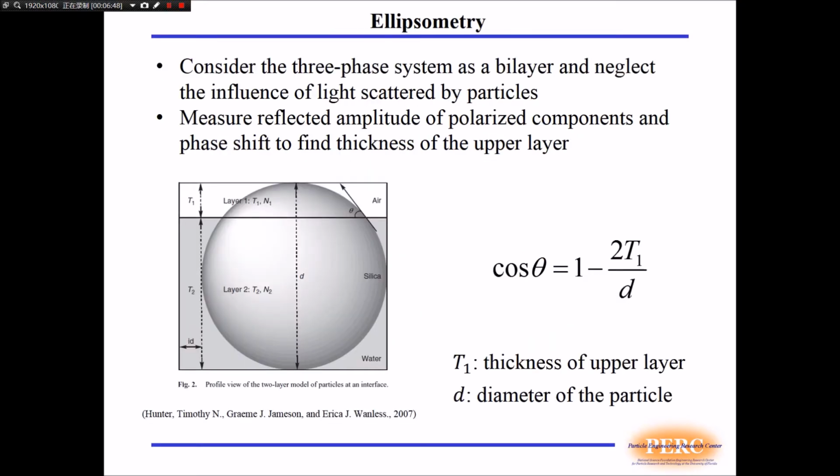If you remember the gas lecture on optical properties characterization, you should be able to recall that ellipsometry is very sensitive to surface conditions. It can resolve thicknesses much smaller than the wavelength of light. The nanoparticle monolayer at the air-water interface can be considered as a bilayer, with the upper layer composed of particles and air, and the lower layer consisting of particles and water.